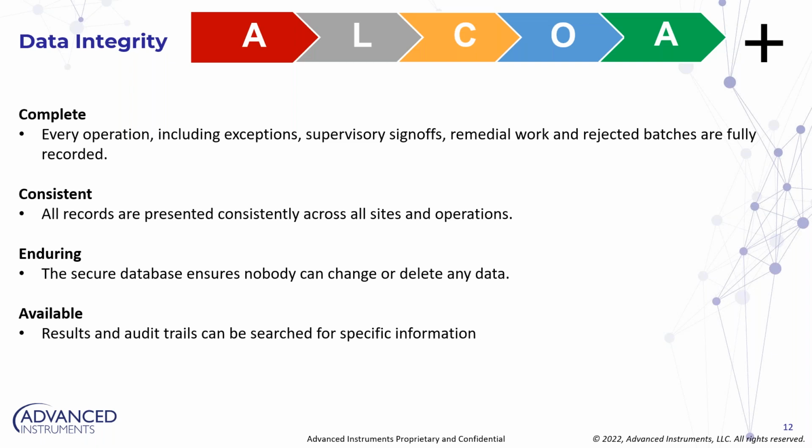So now if I come back to the example I was giving you earlier, where the operator ran a test on the device, was pulled into something else, and walked away from the instrument for 20 minutes. Another person in the lab walks up, sees the instrument blinking, decides to take the sample out, log in, change something, or print some data set, and then log back out. Now when the early user comes back and looks at it, we need to make sure that whatever was done by the unknown user was tracked and traced on the device, right? Because we don't know if what that person did is going to affect what this person had already done or what the next person was going to do.